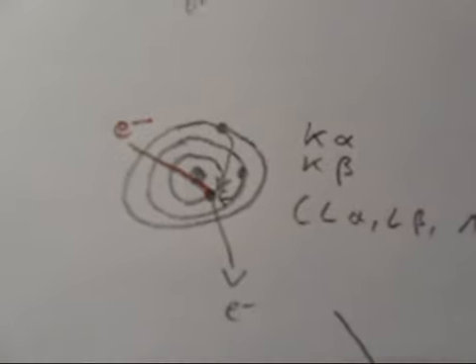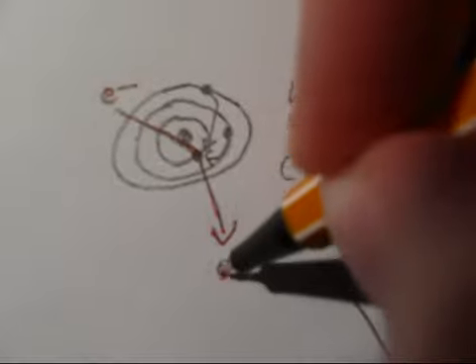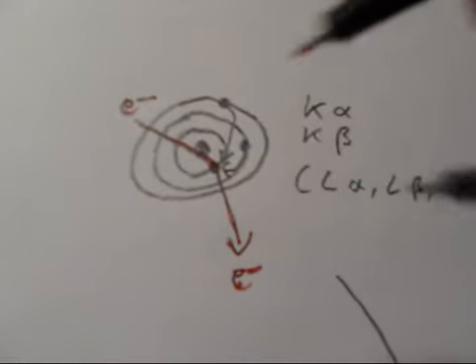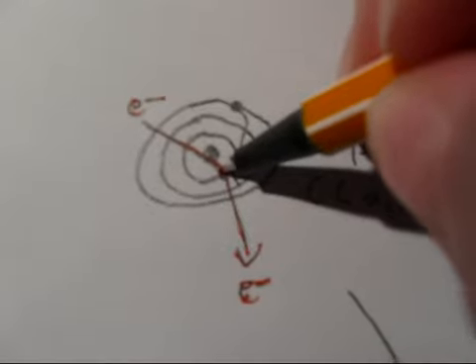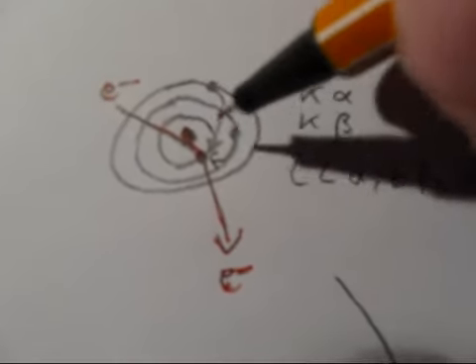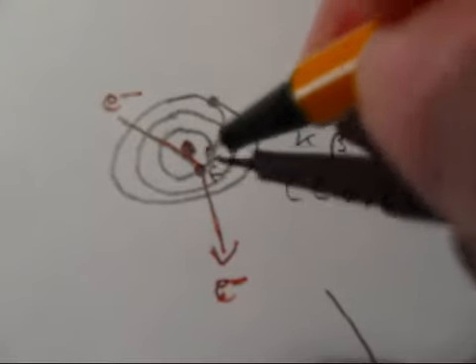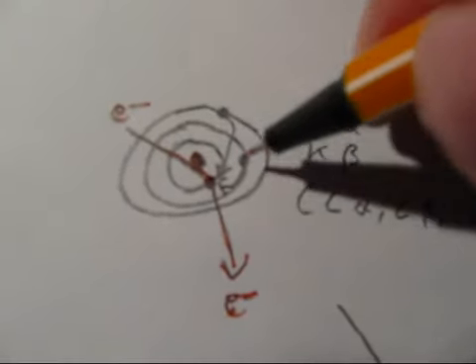That's of course not correct, but just for simplification. So let's say that electron gets knocked out because the electron beam has a greater energy than the binding energy of that electron to the actual atom's core, the nucleus. So what has to happen now, that this shell is missing one electron, so that has to be filled up from another shell.